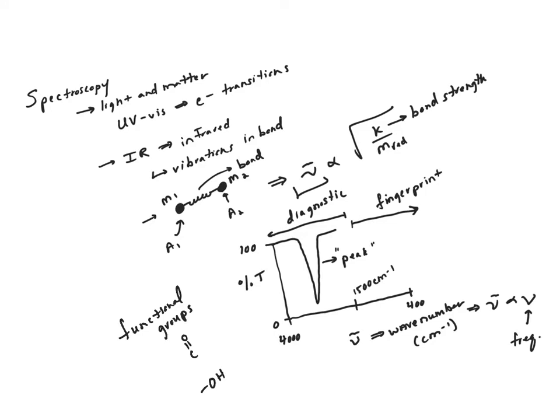Okay, now, last class, for every signal or peak in our IR spectrum, again, when we're seeing absorbance of light, whatever region, there are three characteristics of that peak, right? The first one that we talked about was wave number. This is where it actually absorbs light in the infrared spectrum. This is the x-axis of our infrared spectrum.